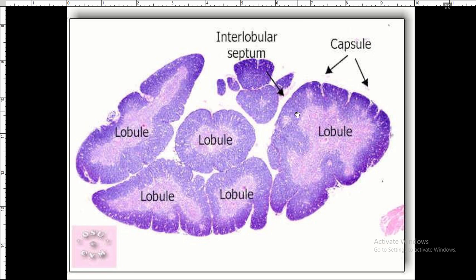So remember, we don't want these T lymphocytes to get into the blood, because they are in the process of maturation. They may end up attacking self rather than attacking foreign. So you need a blood thymic barrier. You understand? Right. Then you're also going to have a medulla.